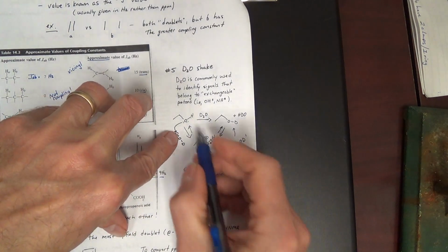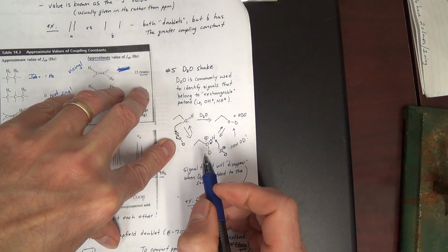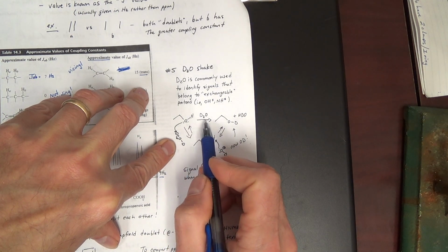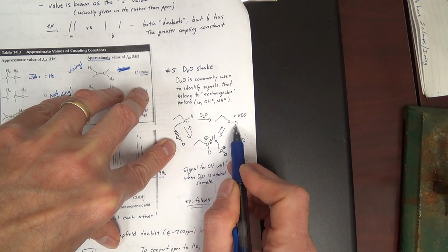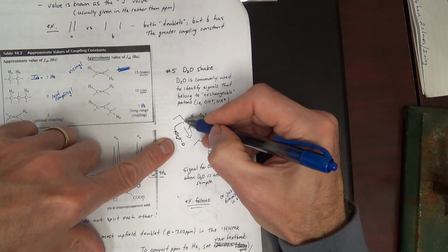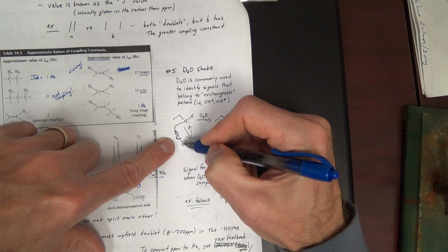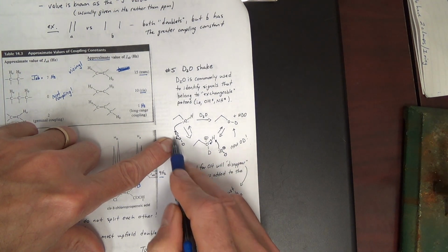Now, we'll explain this further, but if we add D2O here, we can identify exchangeable protons because the H will be replaced with a deuterium. First mechanism. Well, we can protonate the oxygen with the D2O. Now that's a very poor equilibrium because this is not that acidic.